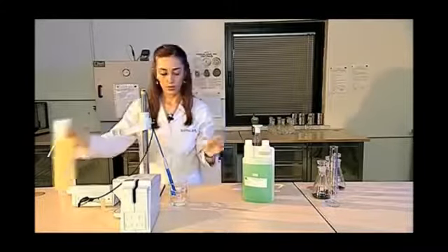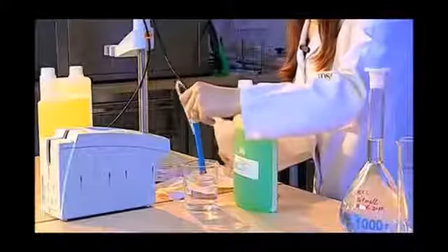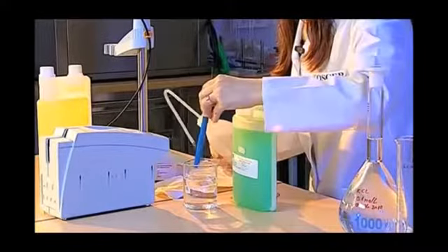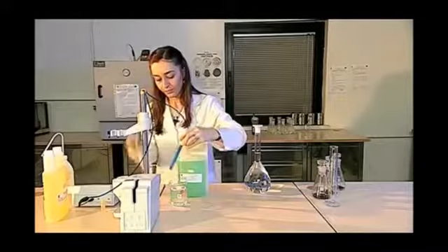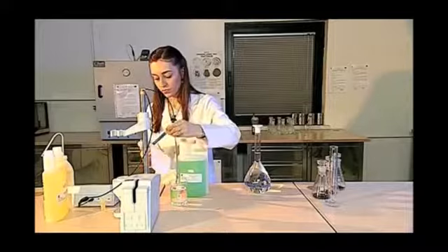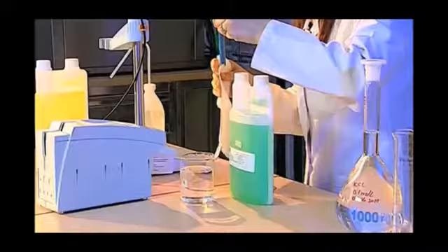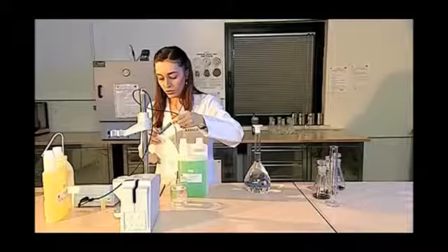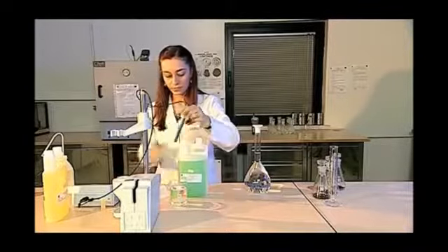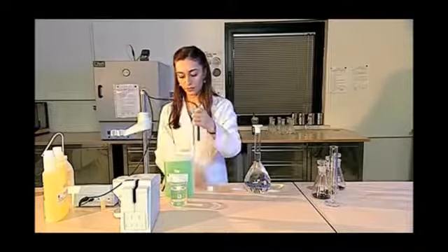In the final stage of the pH 7 calibration, I go back and measure the pH of it, and the calibration of the pH is completed. The tip of the pH meter, namely the tip of the electrode, is a very sensitive piece of apparatus and should never be exposed to shocks, and its tip should be cleaned properly every time.